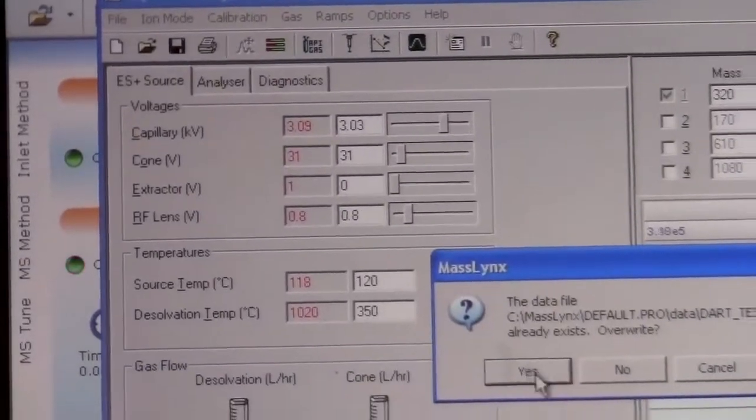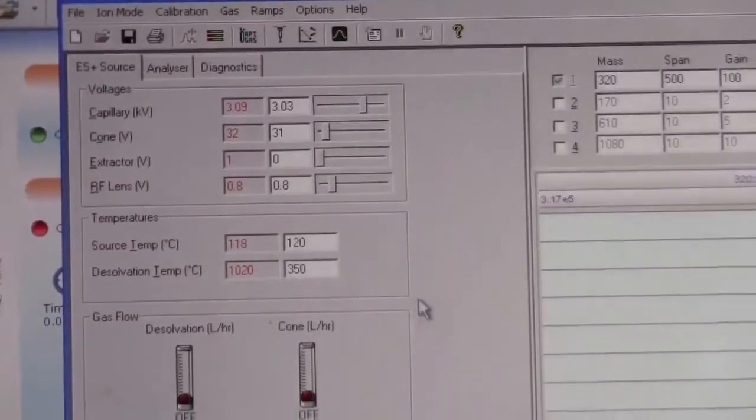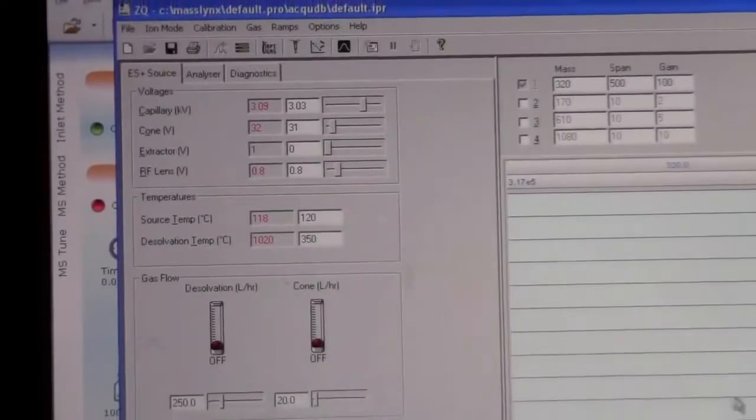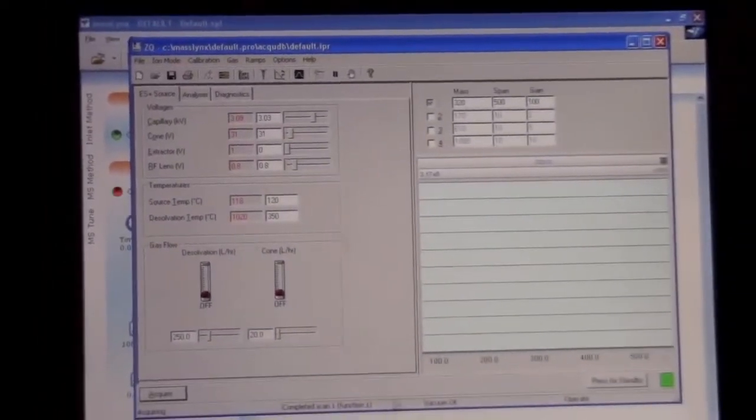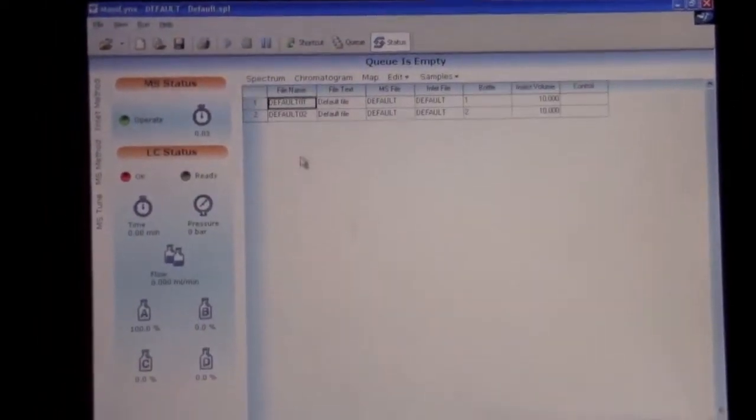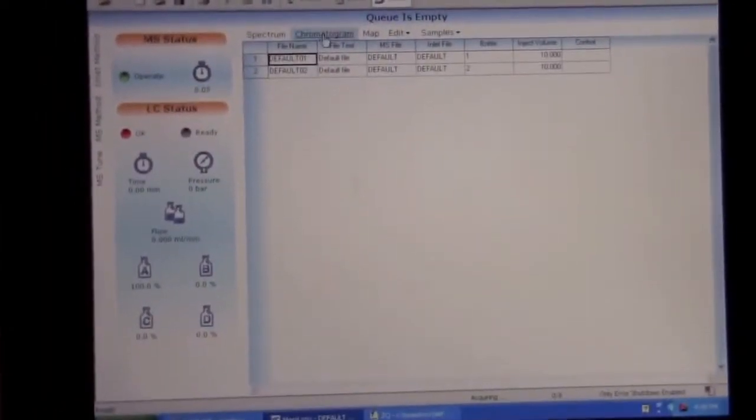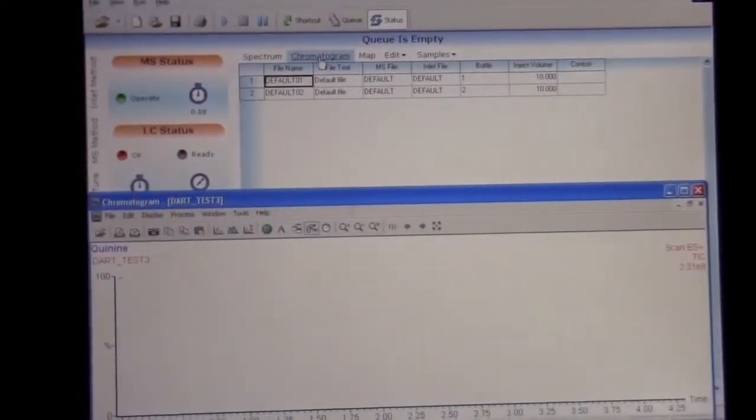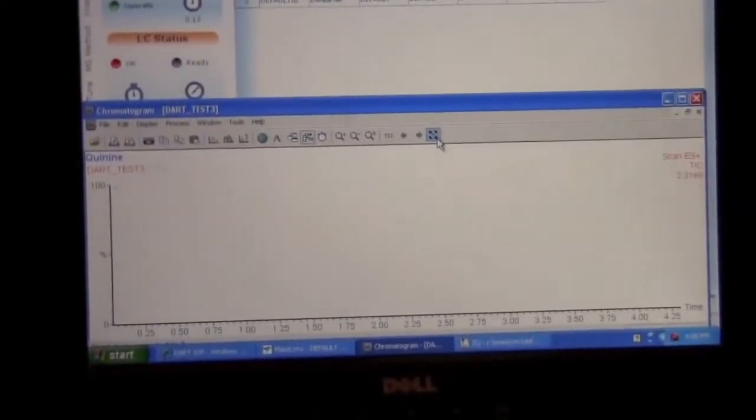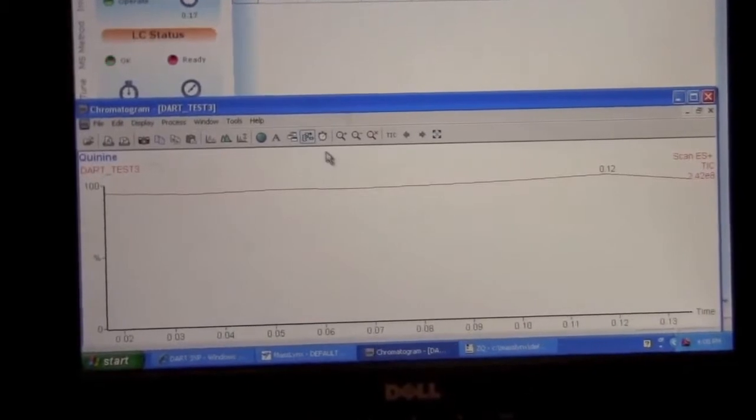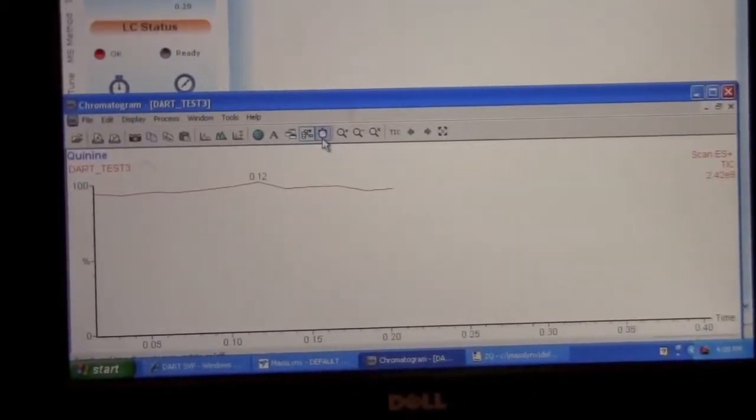In this case, we already have a data set. We're going to overwrite it. So now this disappears and we're running. So we want to go back to the main page here and look at the chromatogram.